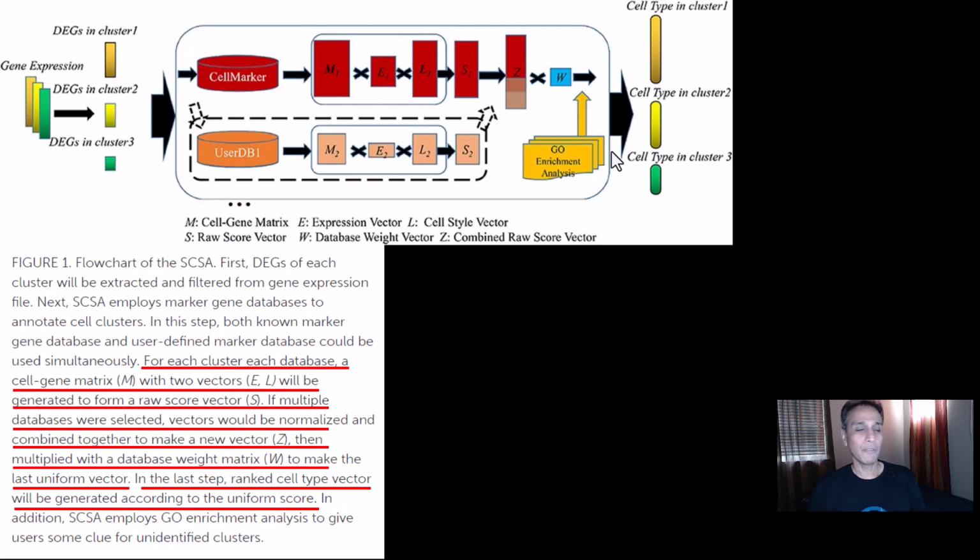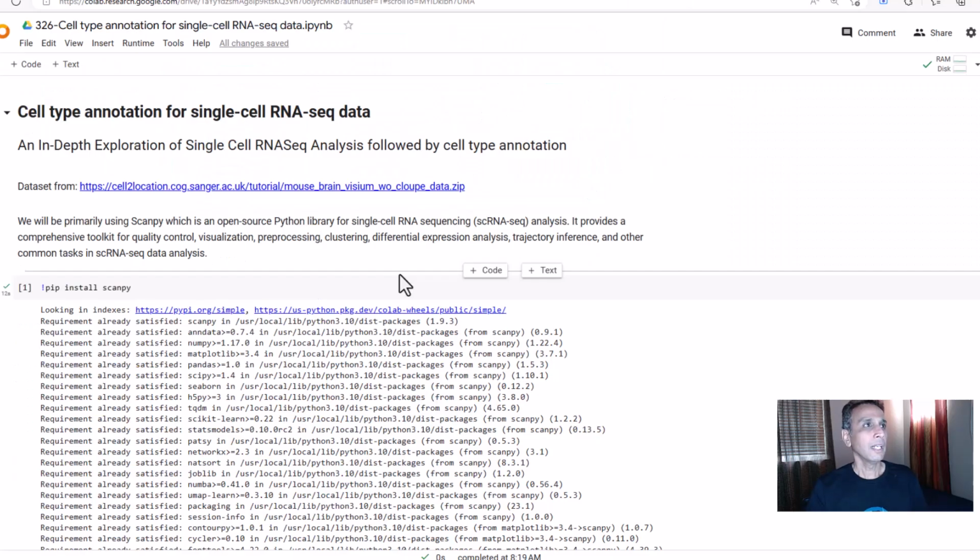I'm sure all of you are eager to jump into the code, so let's go ahead and start looking at our code. As usual, I'll share the code with you. Look for the link down below. And I built this on top of what I've done in the last tutorial. So if you have watched that, you can fast forward a few minutes directly to get to the point. But for those of you who did not watch the last one, here's a quick overview.